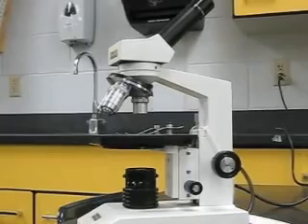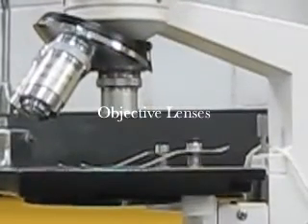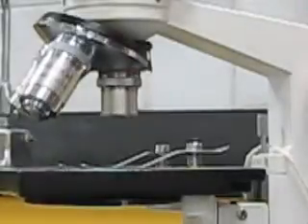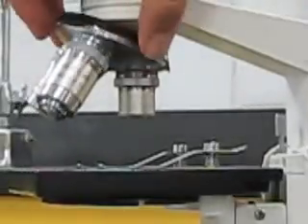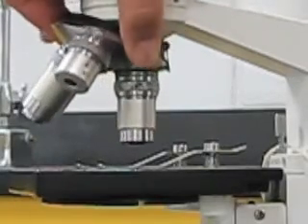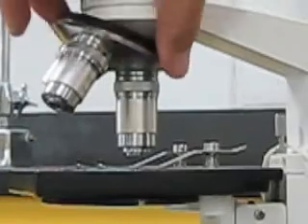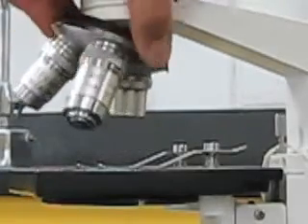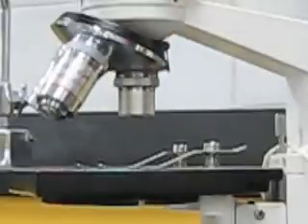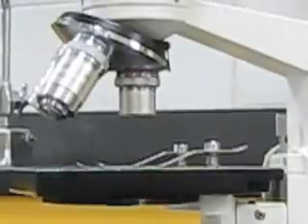The objective lenses are also found in the middle of the microscope above the stage. Most of our microscopes come with 2 or even 3 objective lenses. Each lens gives the viewer a different level of magnification. The shortest lens has the lowest magnification, often called a 4x objective. The medium-sized lens is often the 10x objective, with the longest being the 40x objective.